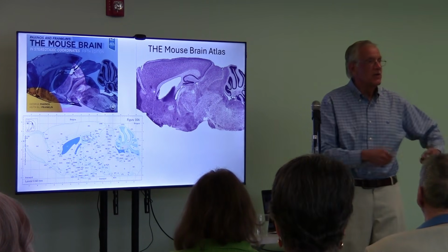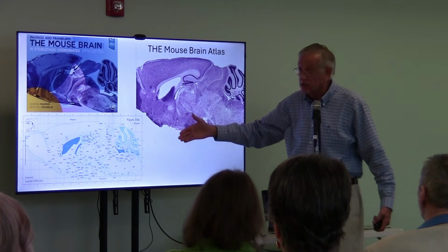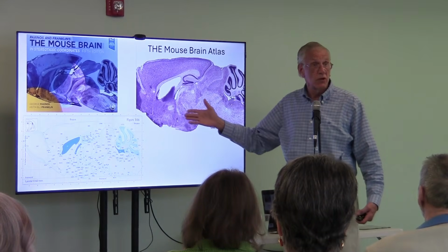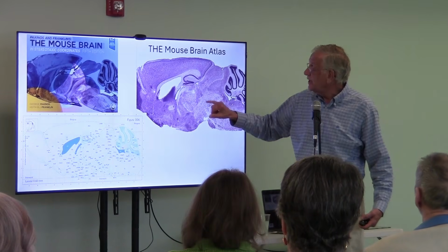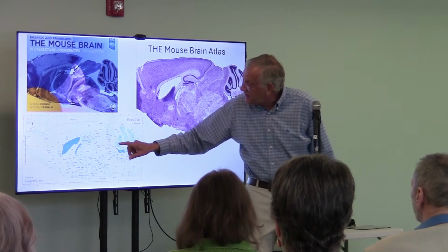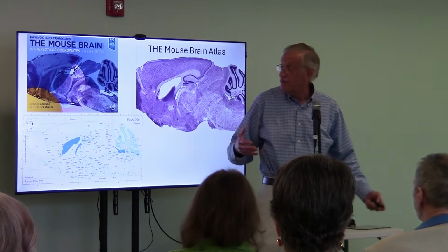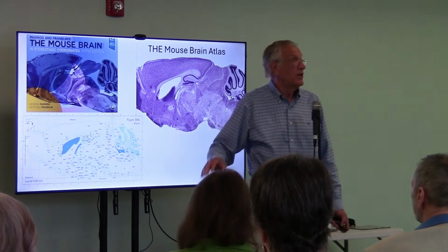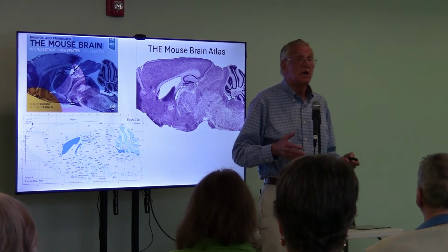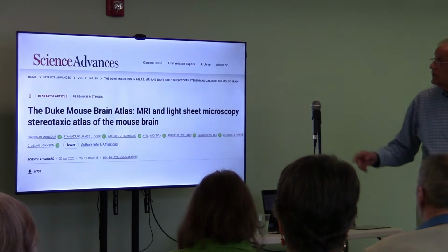He comes in with a long roll of tracing paper, and he creates this book by taking glass slices of a brain, staining them with something called Nissl that highlights structural, these are individual cells, and then he knows that this is the LPAG. I don't know, that could be the lady's professional alternate call. All of these structures, the map. So if you are working on the mouse brain and you want to compare your results to somebody else, you have a copy of this and you report what you find relative to this.